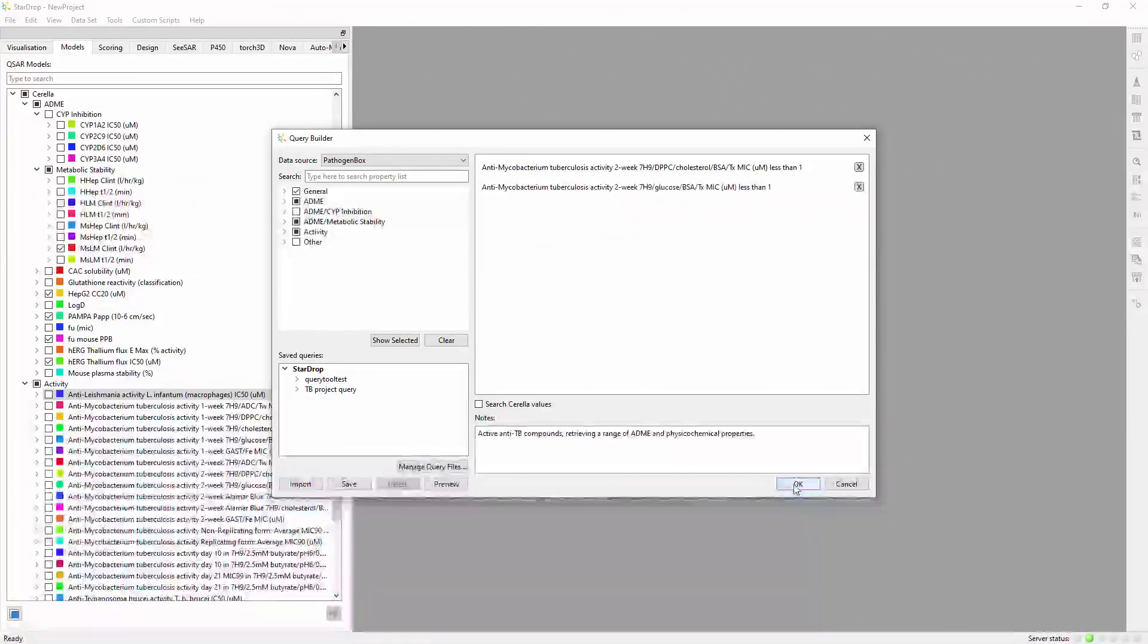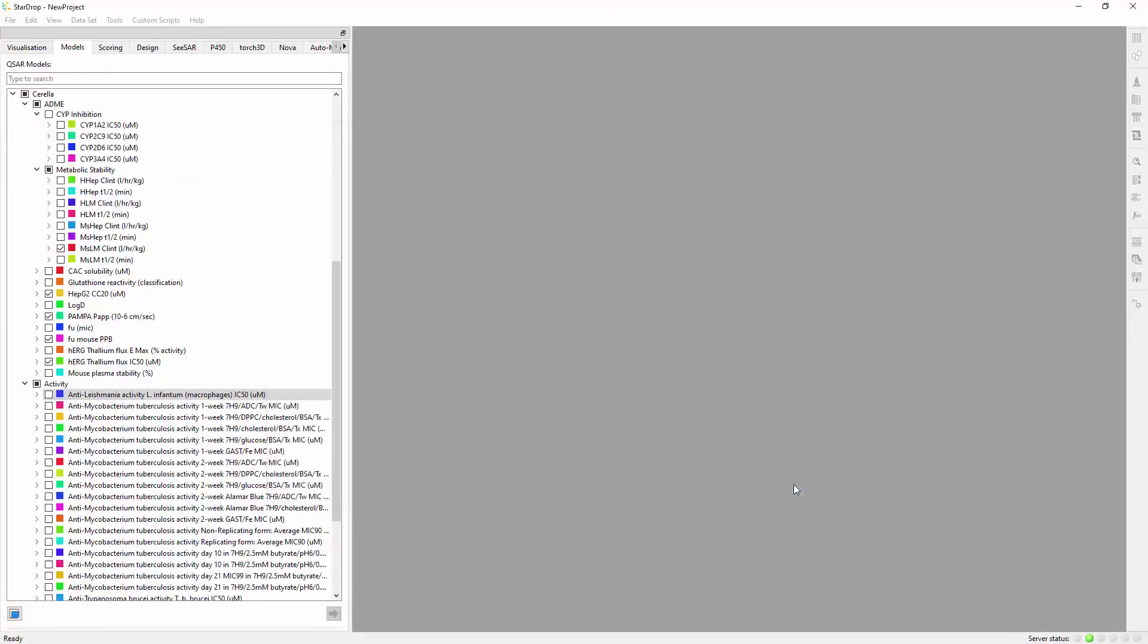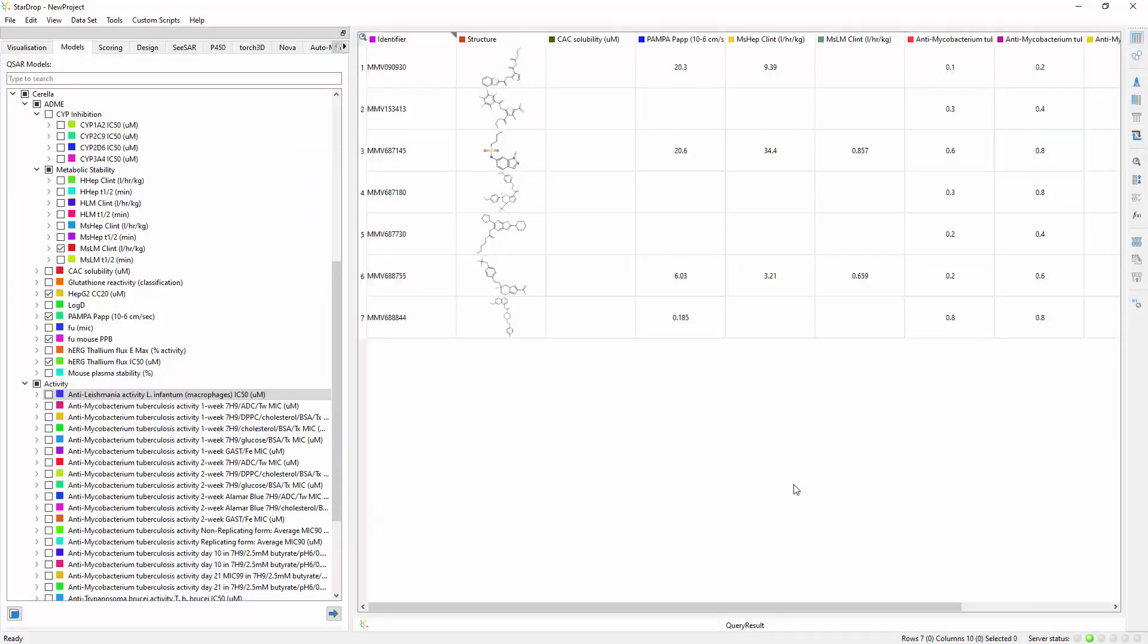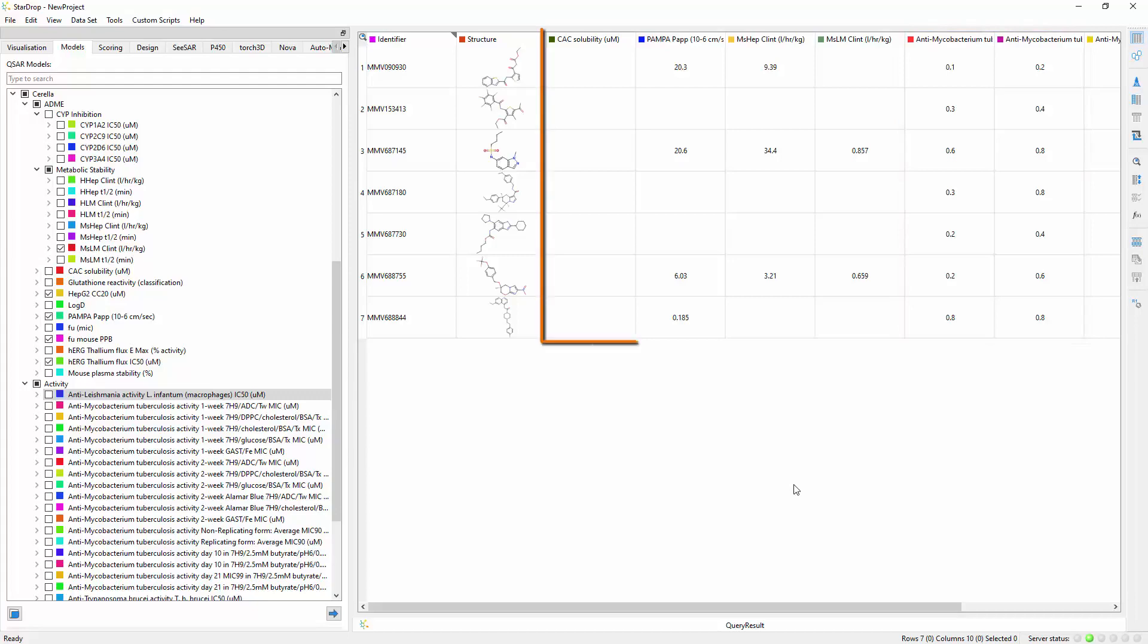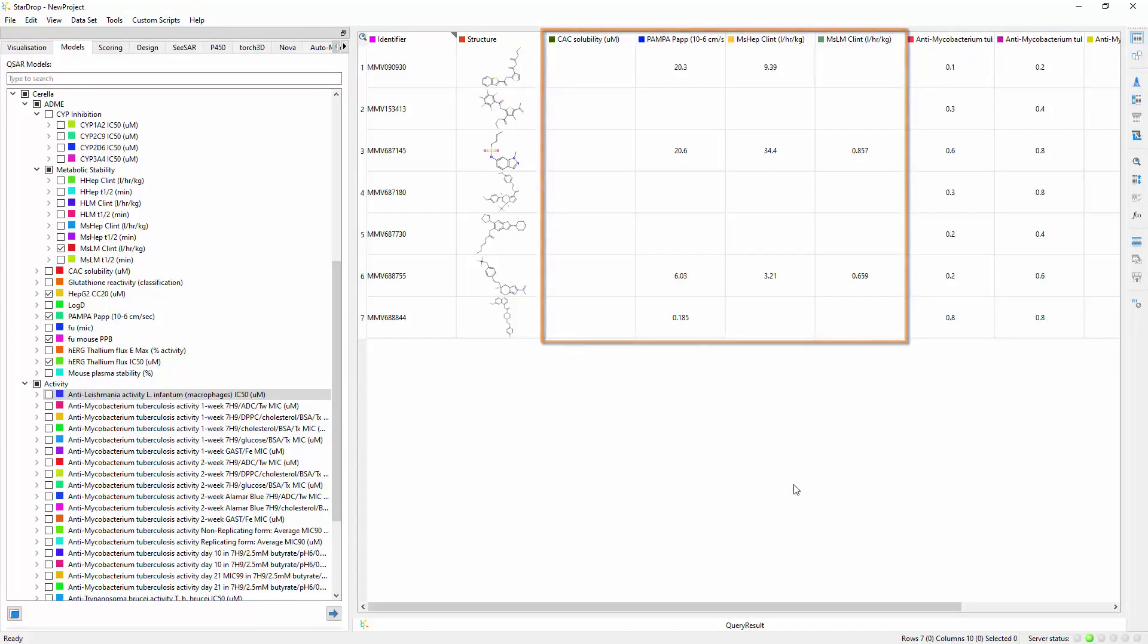Running a query of your experimental database often results in a small number of compounds that meet your criteria, with limited measured data. Here we can see that searching for compounds that are active in two assay conditions returns only seven compounds with limited ADME data.